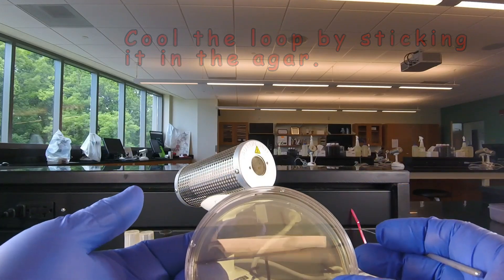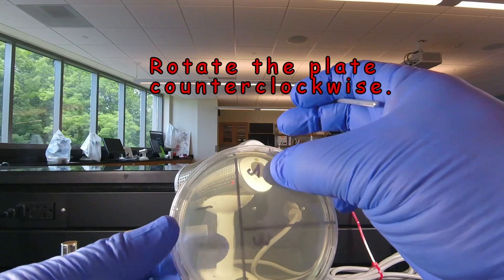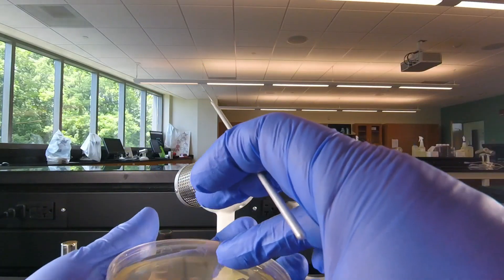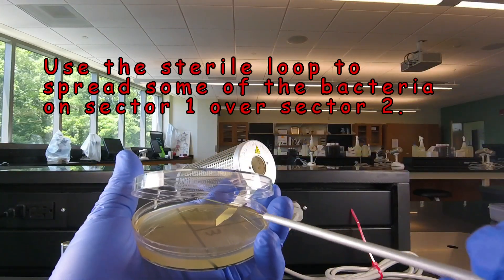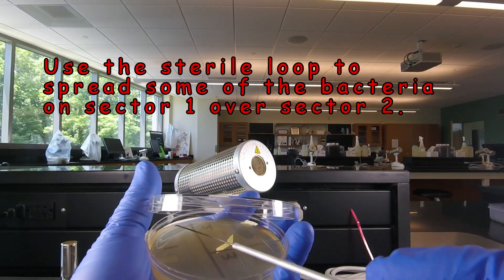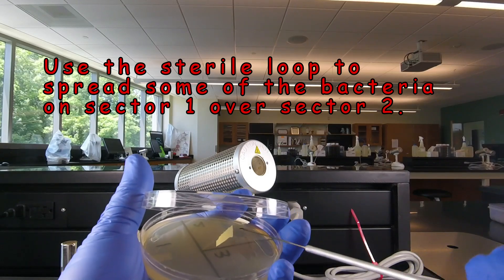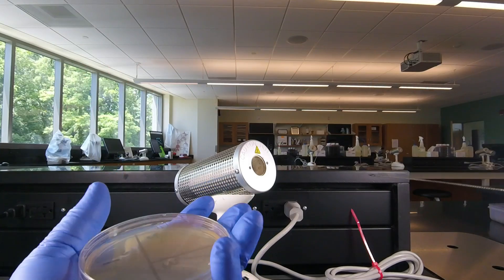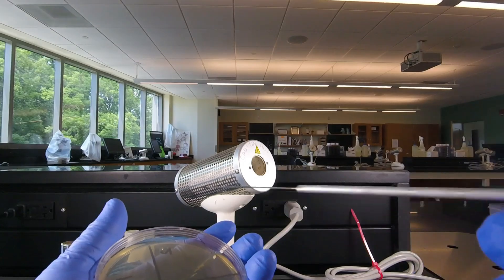Now with the bacteria in sector one, we're going to rotate the plate so sector one is sitting at nine o'clock. Then we open the plate, take our sterile loop, drag it through sector one twice, and spread that out over sector two — one, two — and then spread it out over sector two without dragging it through again. So we've taken a few of the bacteria from sector one and spread those out over sector two.